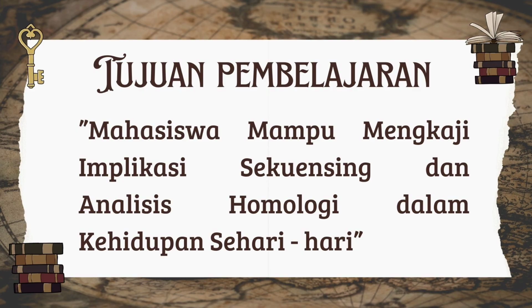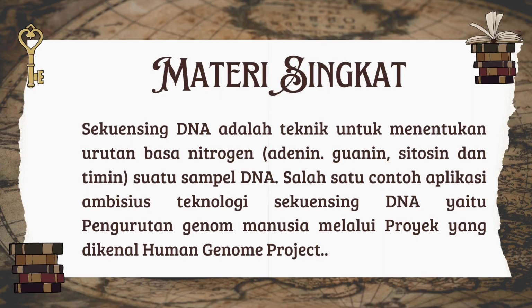Tujuan pembelajaran: mahasiswa mampu mengkaji implikasi sekuensi dan analisis homologi dalam kehidupan sehari-hari. Sekuensi DNA adalah teknik untuk menentukan urutan basa nitrogen atau adenin, guanin, sitosin, dan timin suatu sampel DNA. Salah satu contoh aplikasi ambisius teknologi sekuensi DNA yaitu pengurutan genom manusia melalui proyek yang dikenal sebagai Human Genome Project.